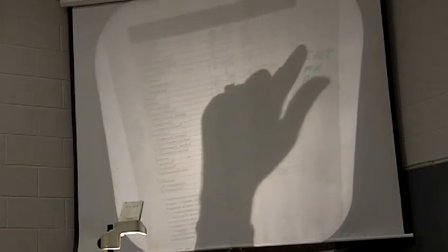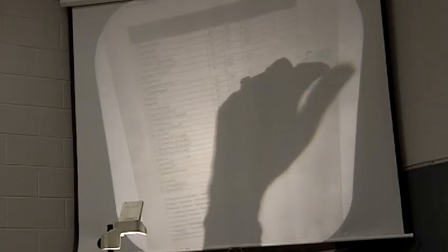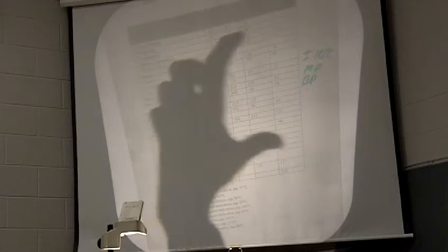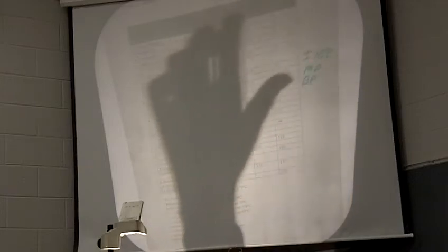Okay, and just remember, don't look for just the exact melting point or boiling point. Go plus or minus 10 degrees. So you're going to have a 20-degree range that you're looking over for possibilities.